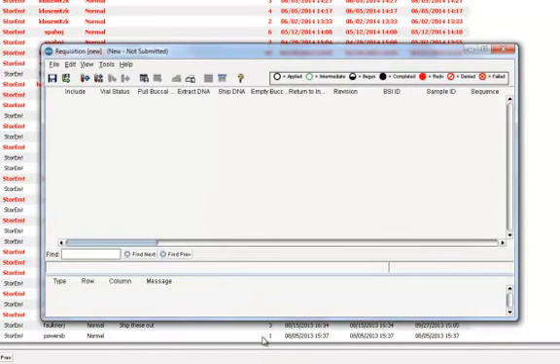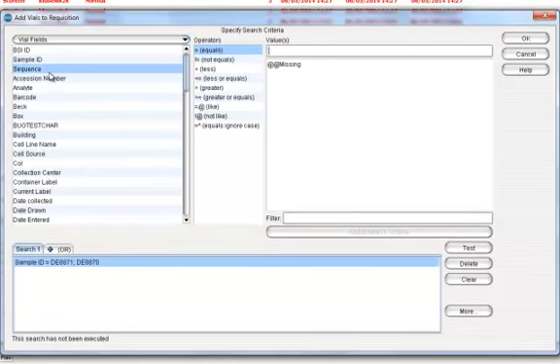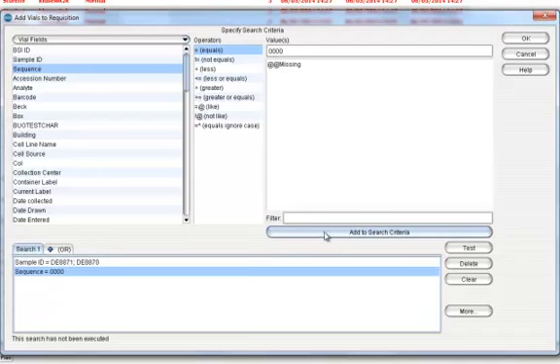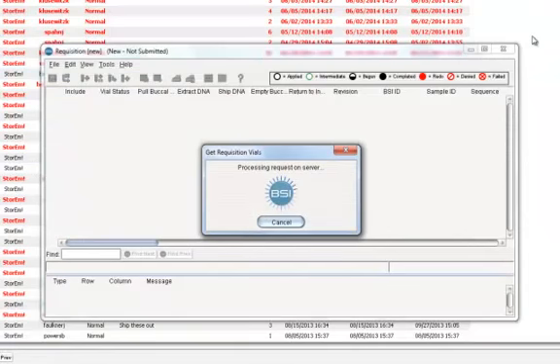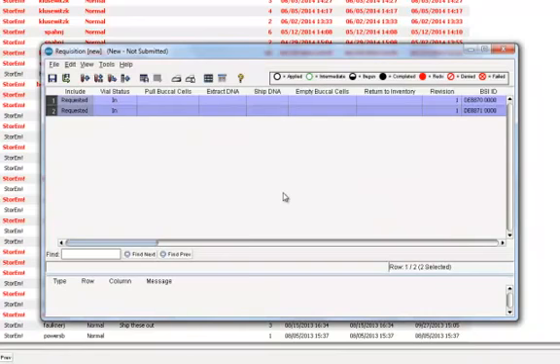For this example, I will add a couple of buccal cell specimens. Next, I will submit the requisition and open it for processing when I am prompted.